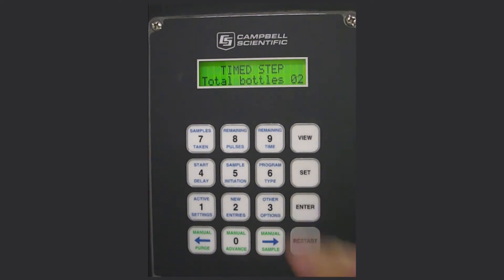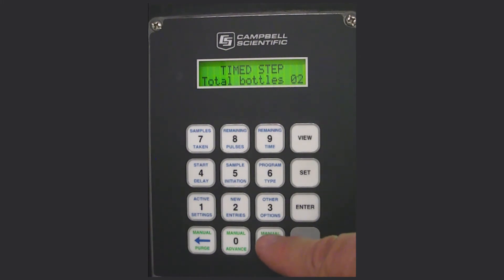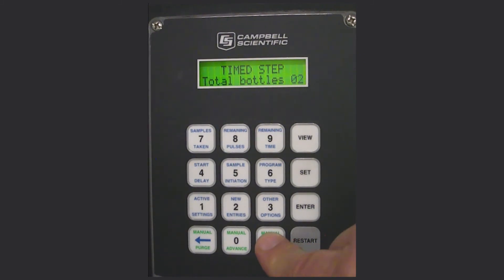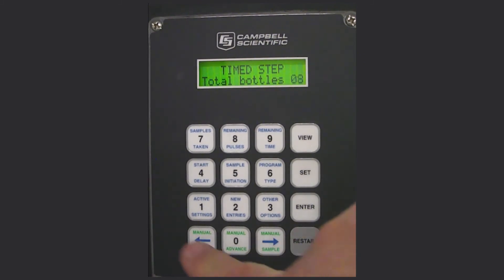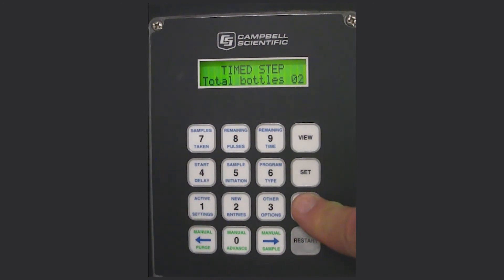Press enter and then select how many bottles are in the sampler. In this case the sampler has two bottles as a discrete sampler, meaning it will sample a set number of times into one bottle and then at a given time switch and begin sampling into bottle 2. To change the number — if you have 12, 10, or 24 bottles — just right arrow until you reach the number you have. Here we have two bottles, so press enter.